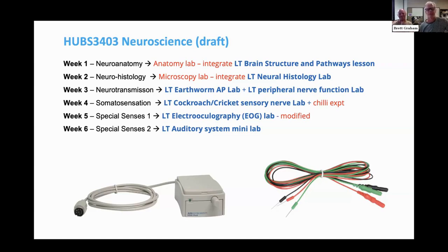Brett has used the LT platform for a number of years now. I feel like a Johnny come lately. I'm only just beginning to see the power of the LT system. But insofar as migrating, that's exactly what I'm going to have to do. Well, not have to, but want to do with the histology.